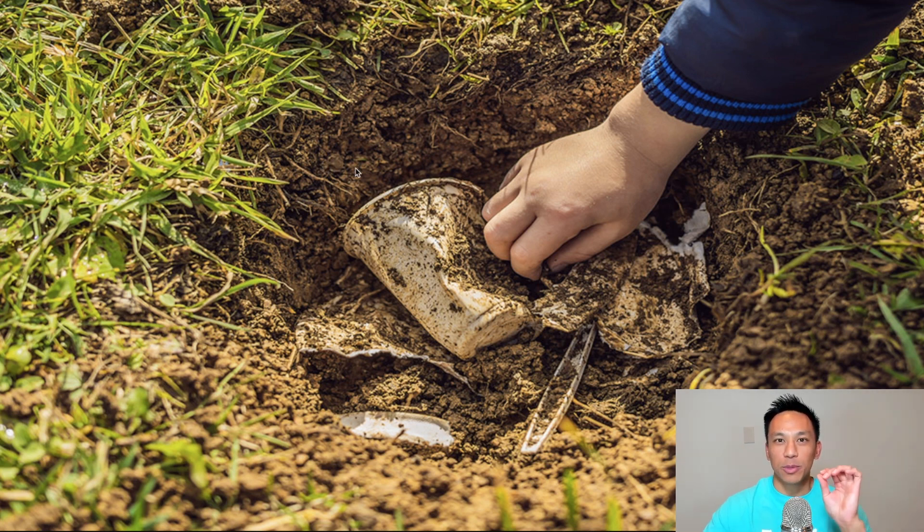Biodegradable disposable gloves are actually made of plant-based polymers that are strong and durable when they're used. However, when they're placed in a landfill, it actually allows the material itself to be broken down into different organic materials.